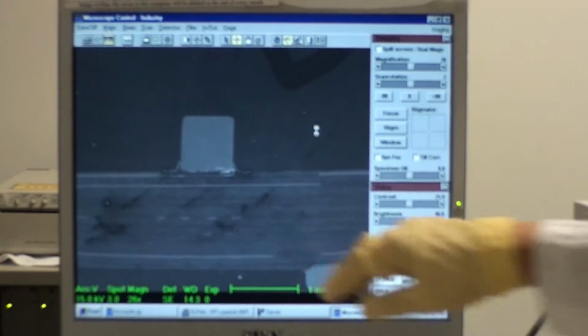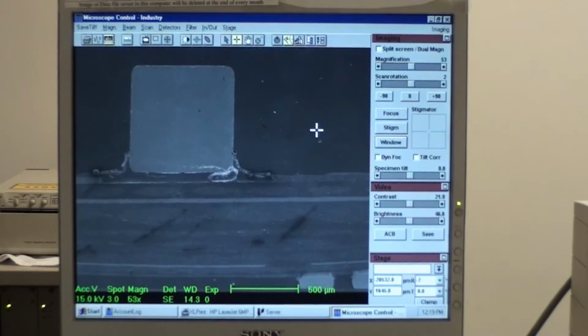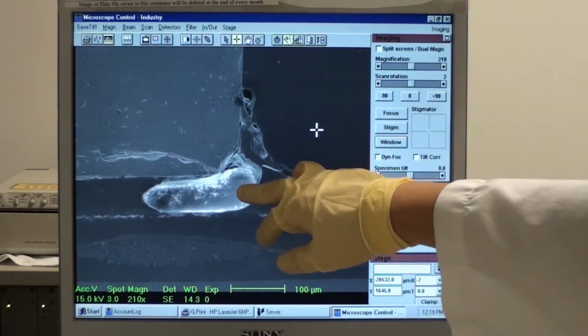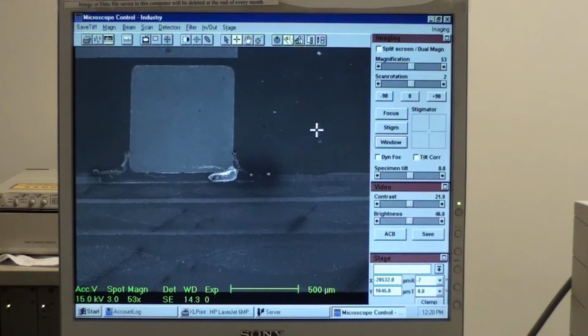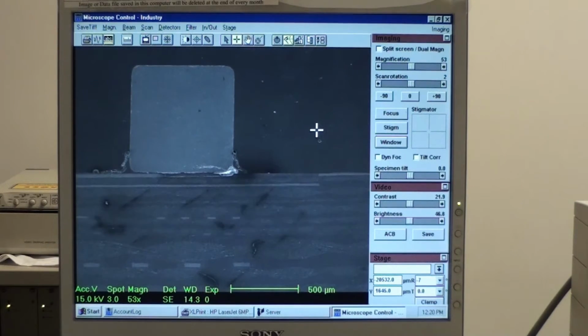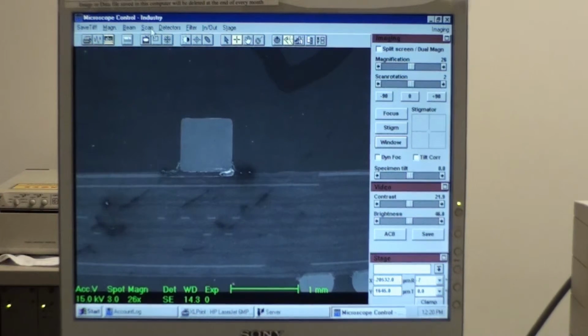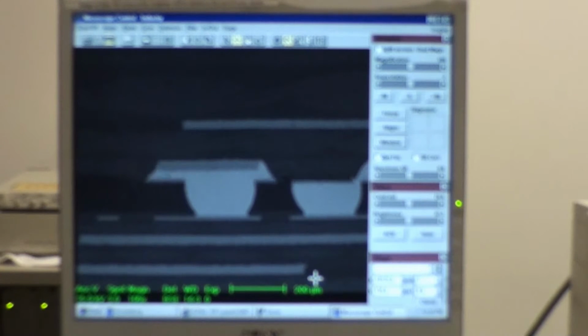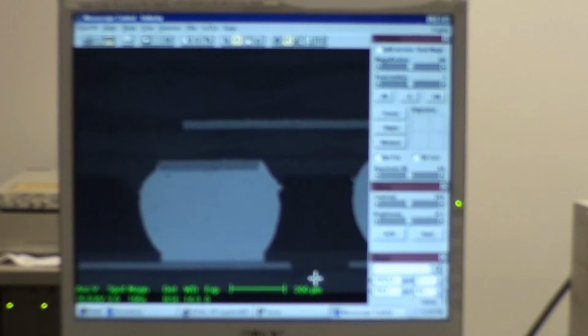At this point, after we magnify, we can easily find cracks, also voids and bubbles. This is how the secondary electron mode works. And now we change to the backscattered electron mode. Now we can see the image is totally changed. Because of the deeper interaction volume, the BSE mode image has higher contrast. And this contrast gives us a clear view of the material and the phase.